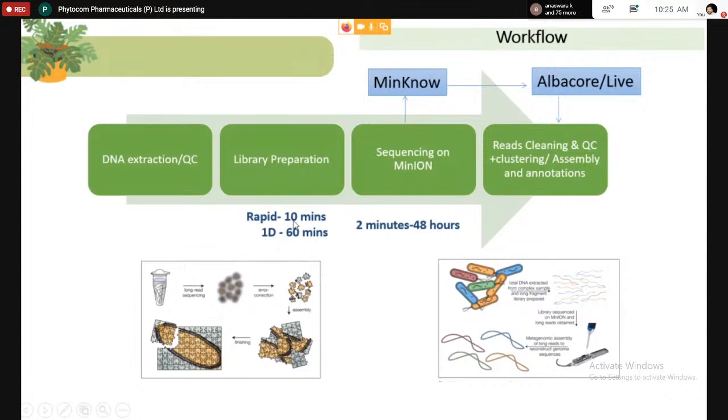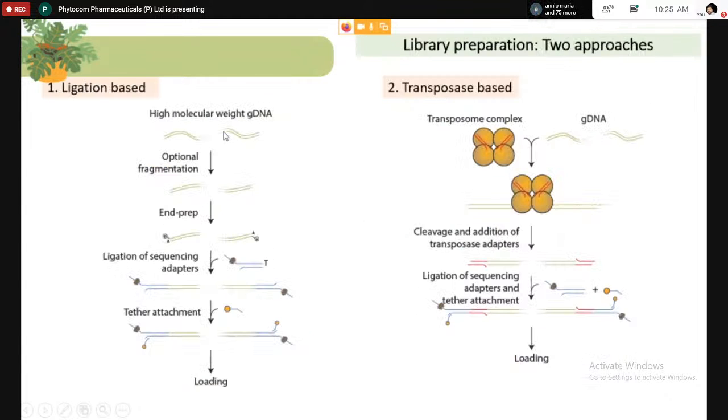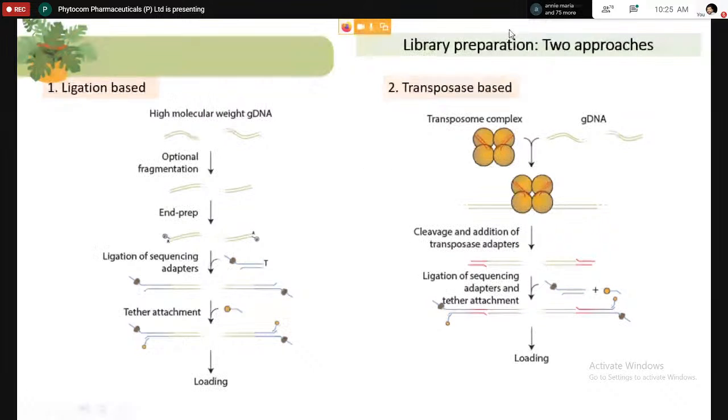This rapid method I already told you. You can use it for field purposes, and the 60 minute method is used for multiplexing when you have a larger number of samples. So these are two methods. This is a transposase based method, which is generally used in Smidgion sequencing. These reagents are very stable at room temperature, so you can take them to the field and isolate the DNA from the sample, whether it is leaf virus or bacteria, whatever you isolate from it.